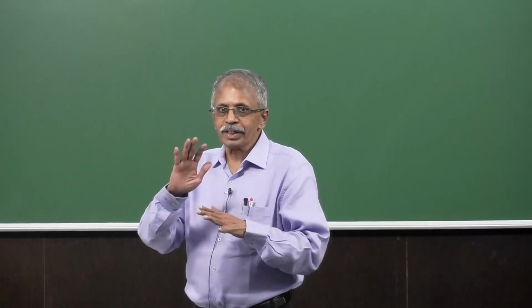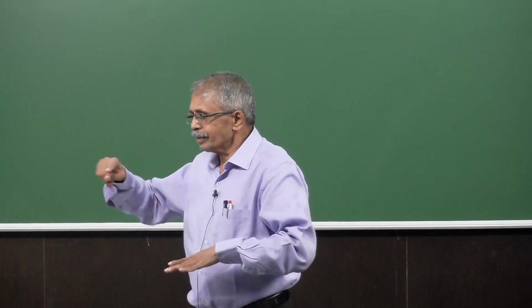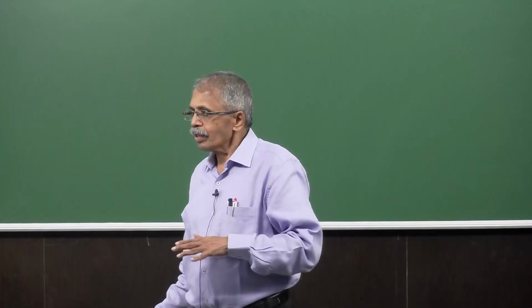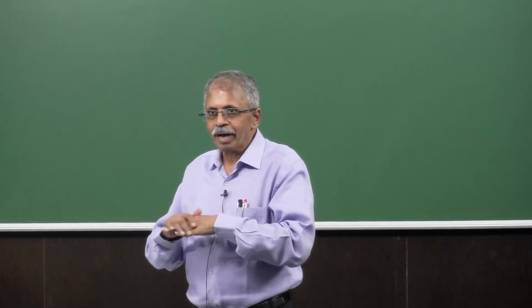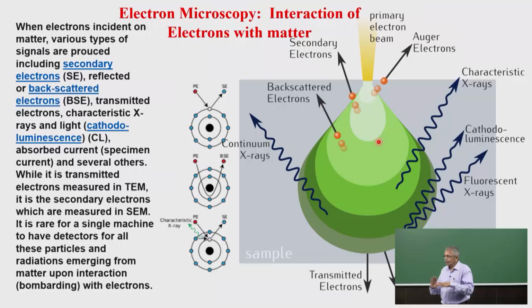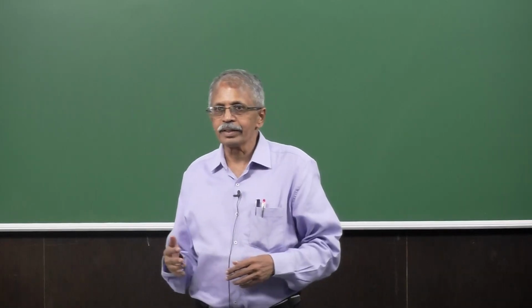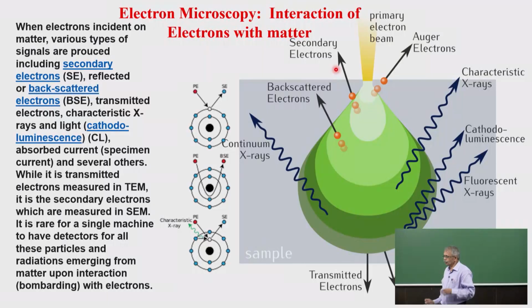Without touching any of your atoms or molecules, they go through the regions which have no electron density. Or they can hit another electron in your valence band or even core, and knock out that electron. That is your secondary electron. Where did we study this? We have studied this already in photoelectron spectroscopy.